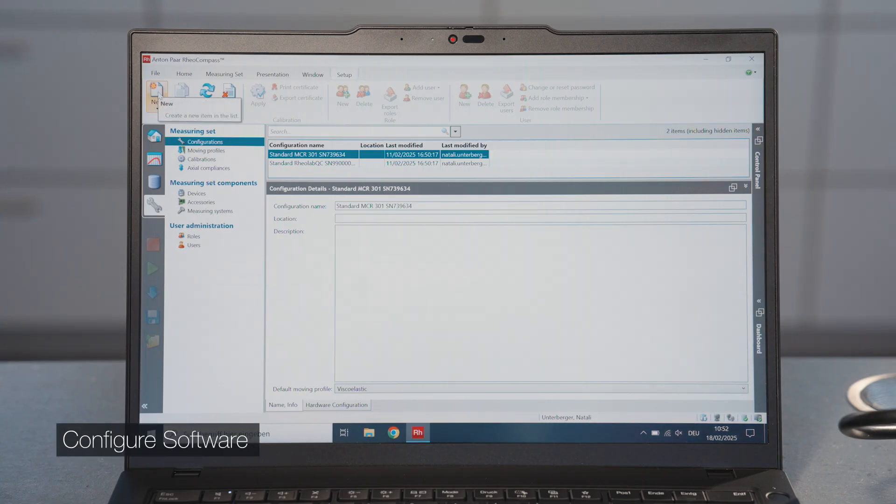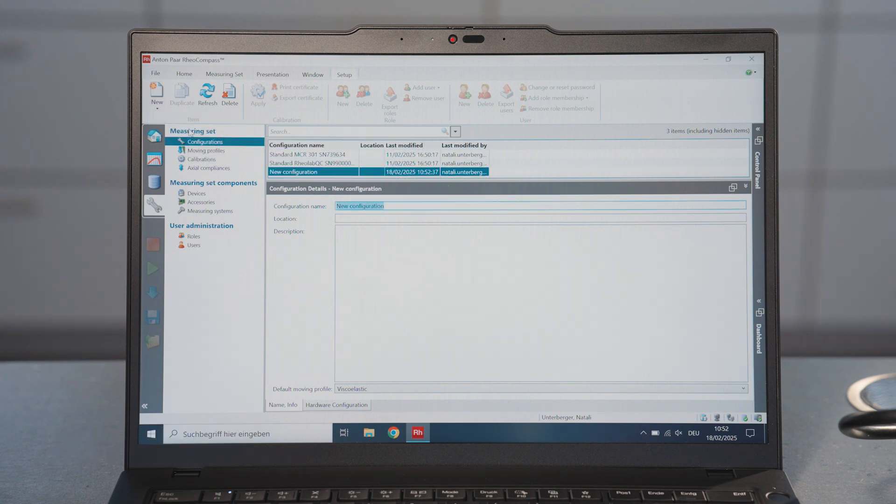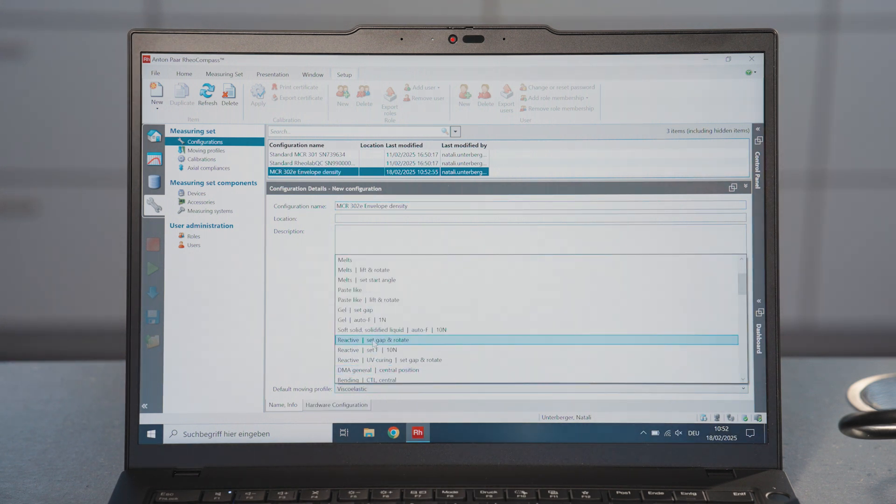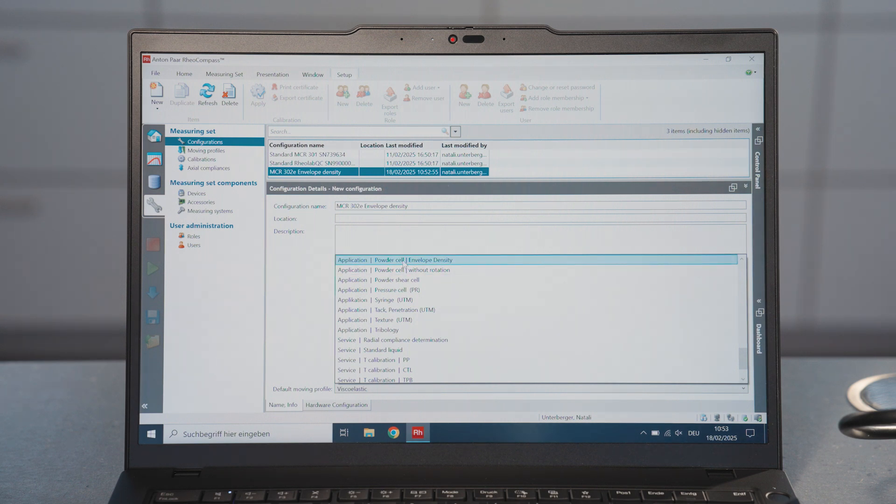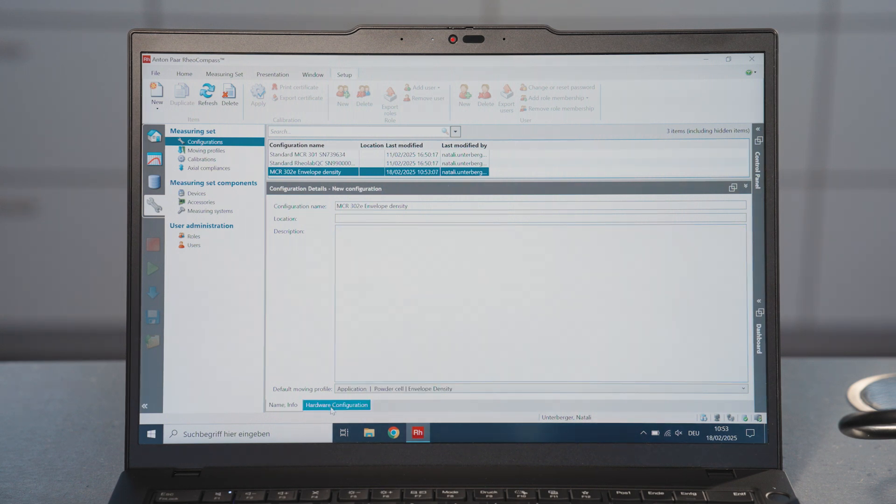Create a new configuration. Set a name and define the moving profile. Specify the device to be connected in the hardware configuration.